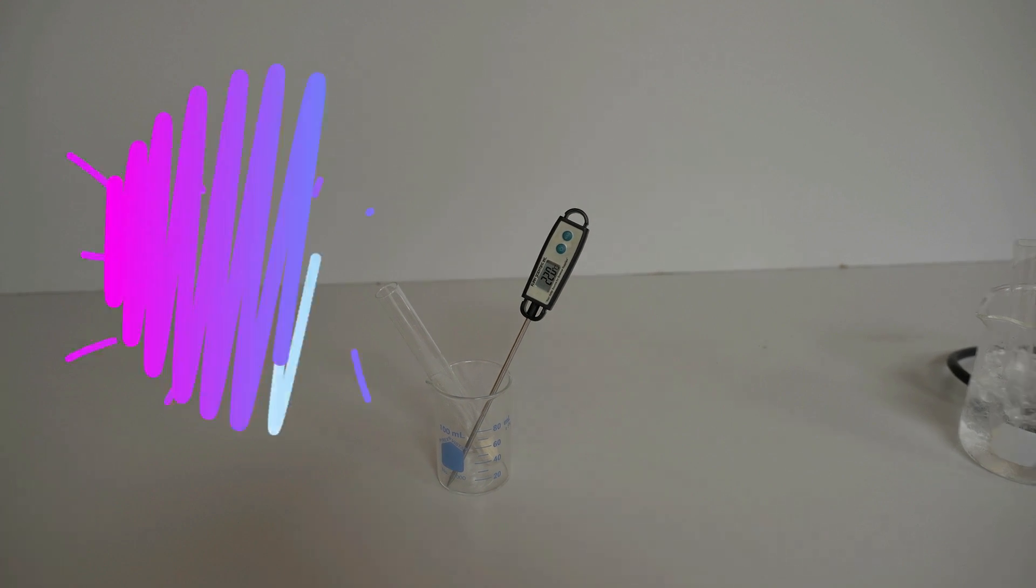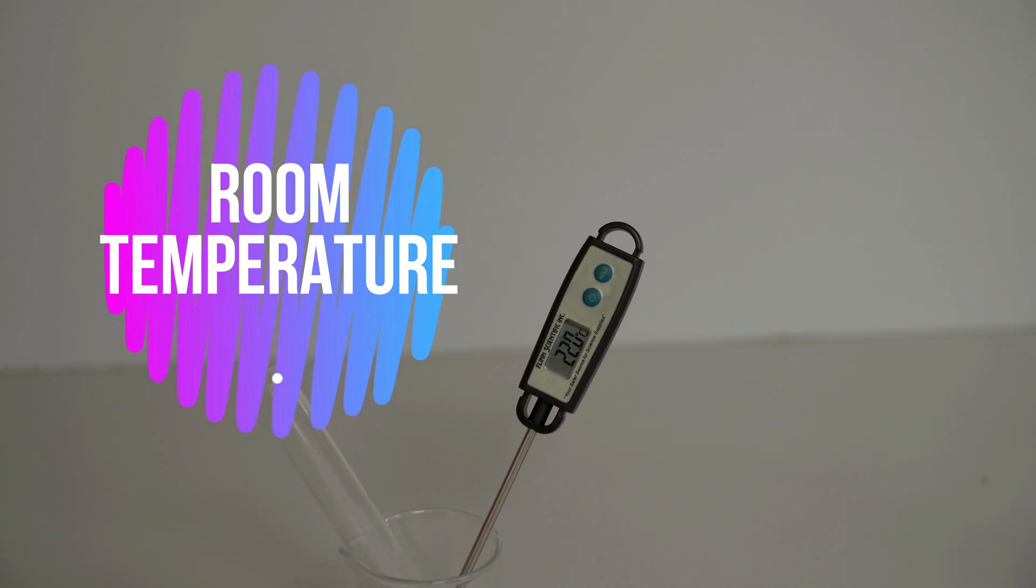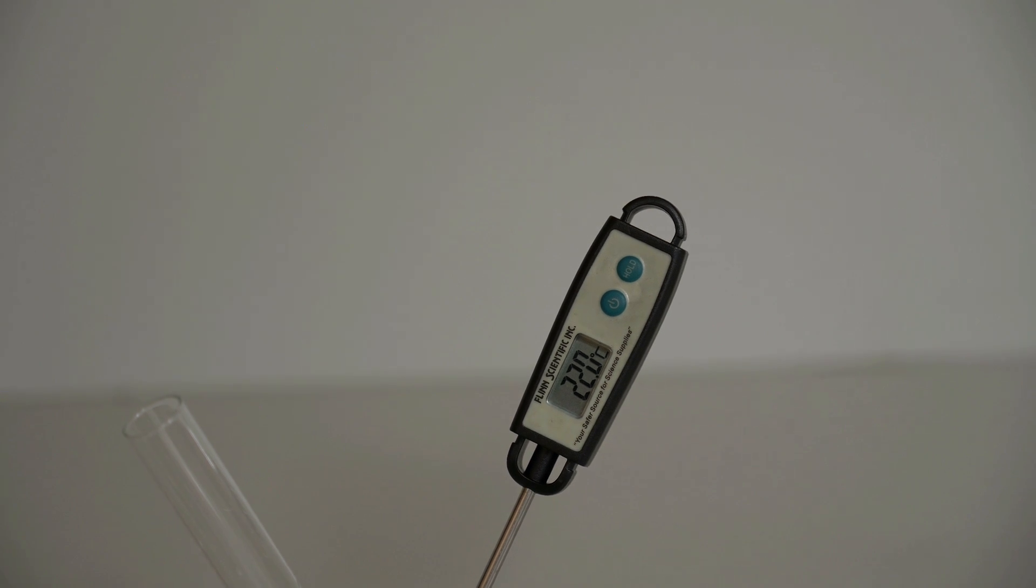Okay, so moving on to room temperature. We can see here the room temperature one has balanced out at 22.0 degrees Celsius.